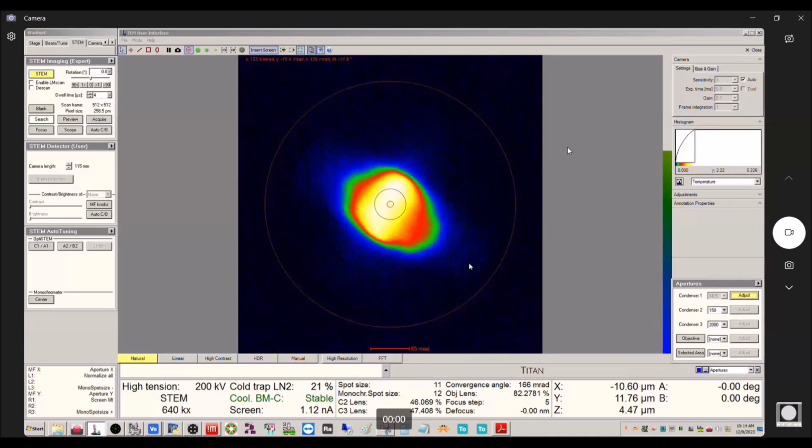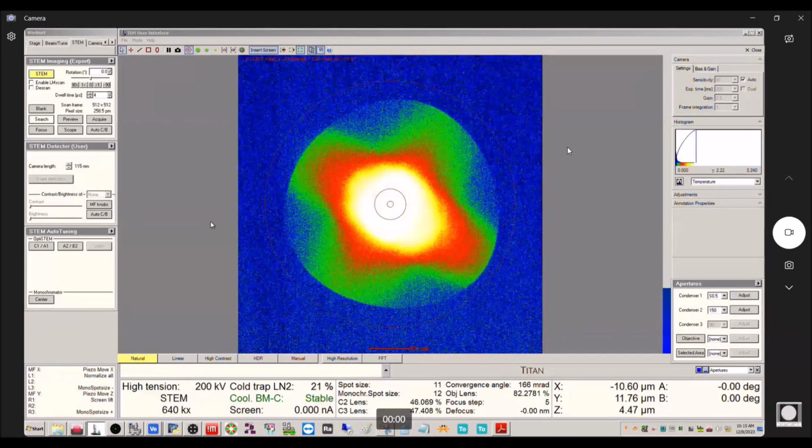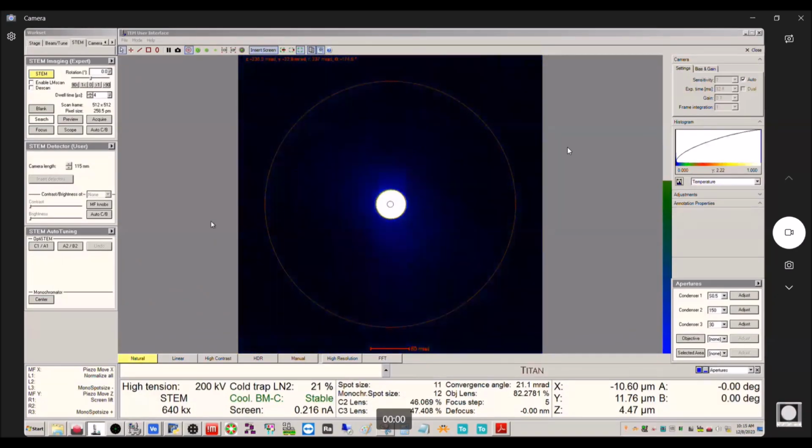The aperture X. I'm getting a little bit more current here. That way. Okay, that's a little bit better. Right, so we'll de-adjust that, and we will, whoops, sorry, just habit of using C2, right? We'll put this back to this guy.